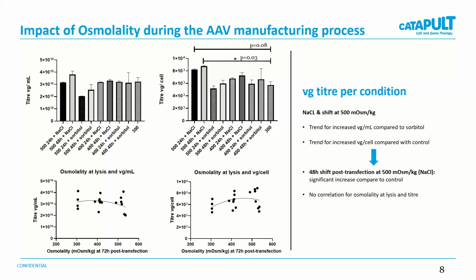And our conclusion for that was there was a significant increase in titer for a shift happening at 48 hours post-transfection at 500 milliosmol using sodium chloride.